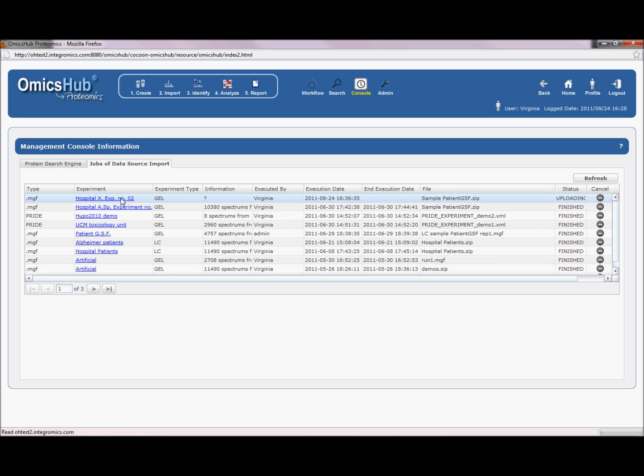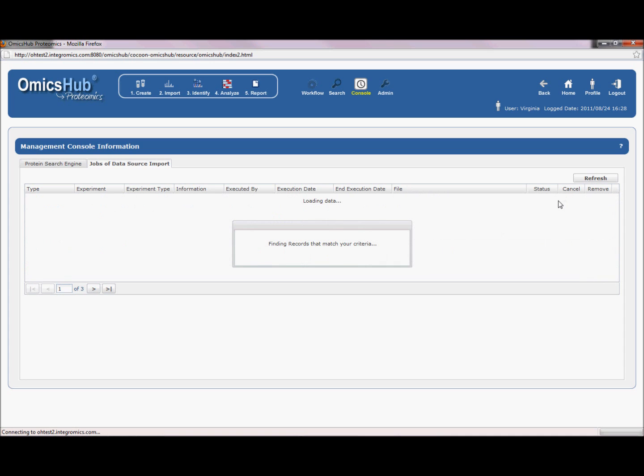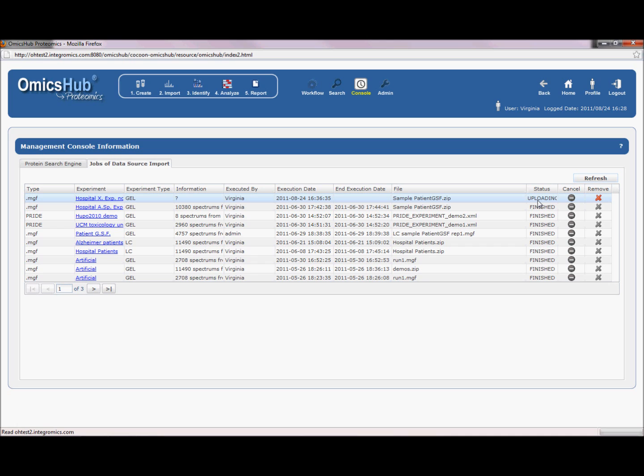that experiment. So it says that it's uploading. If we refresh, probably it will say that it's importing. You see, it's uploading yet. Okay. So we could do something else.